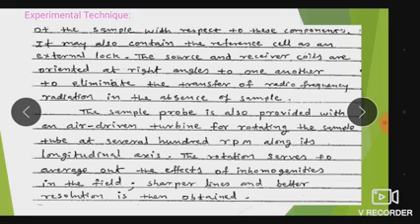It may also contain the reference cell as the external lock, and the internal lock is there. The source and the receiver coils are oriented at right angles to one another to eliminate the transfer of radio frequency radiation in the absence of sample.